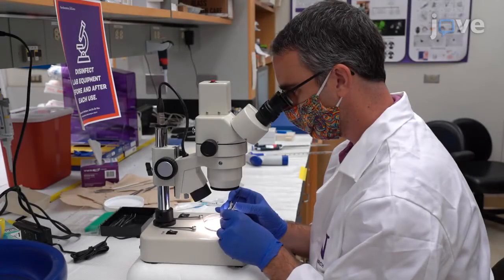Begin by preparing the digestion buffer according to manuscript directions. Using a dissection microscope and 10x total magnification, remove the remaining conjunctiva and optic nerve from the eyes.